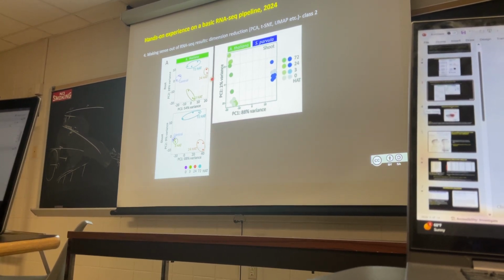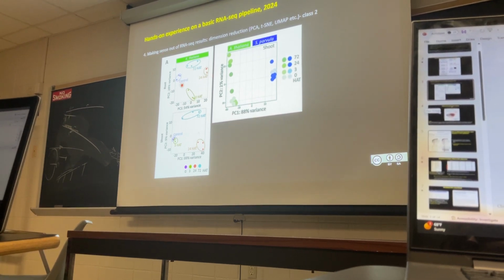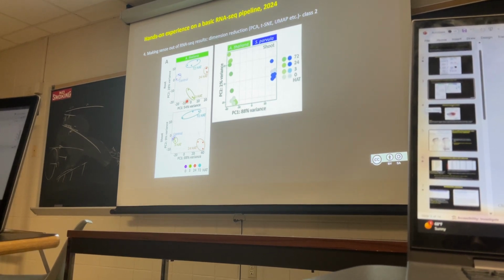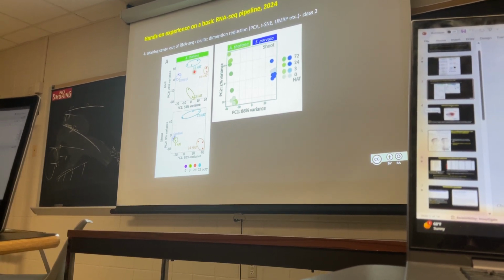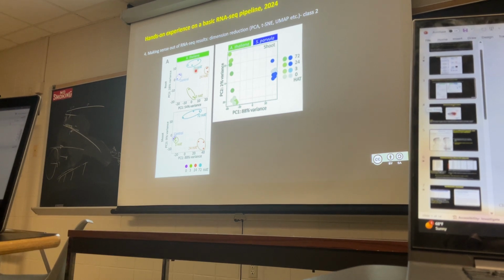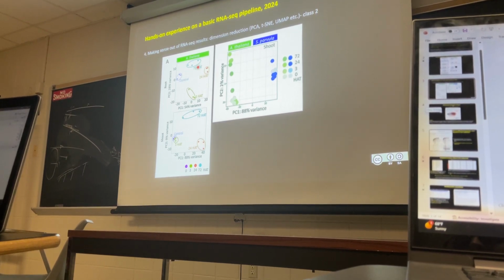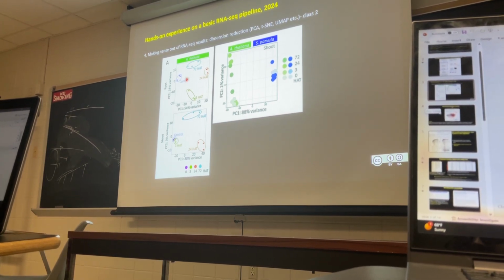This is one example of principal component analysis, where you can see the control sample has three biological replicates, and the same for the salt treatments at 3 hours, 24 hours, and 72 hours after salt treatment. You can see that the transcriptomes of each of these samples are distinct from one another. That's what we can say from here, right? The control sample has a distinct transcriptome from 3 hour, 24 hour, or 72 hour, and each of those samples differs from the others. That's what it means here.